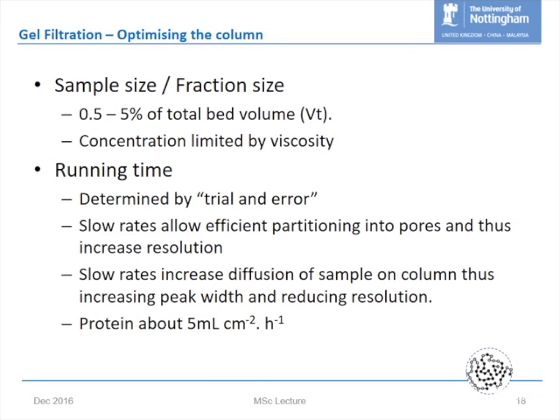If you have too high a flow, you don't get so much peak broadening, but you don't get so much interaction with the bed, and therefore the peaks, rather than being separated, are close together. So they're the sort of optimization things that you can do.